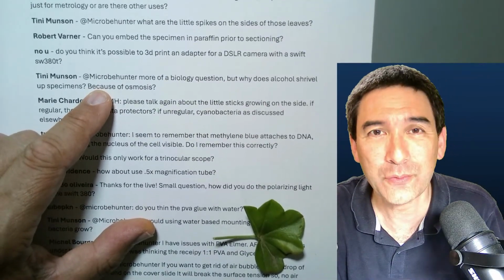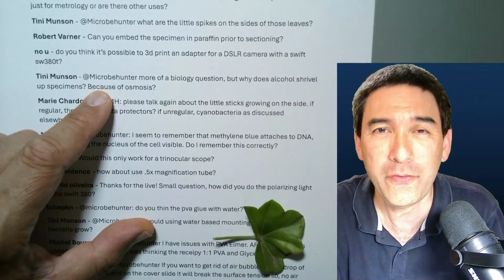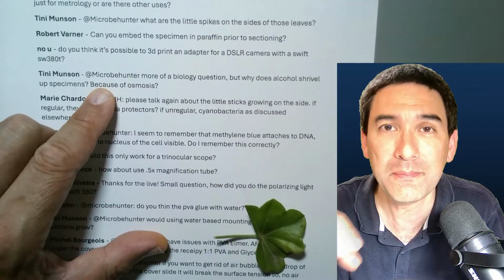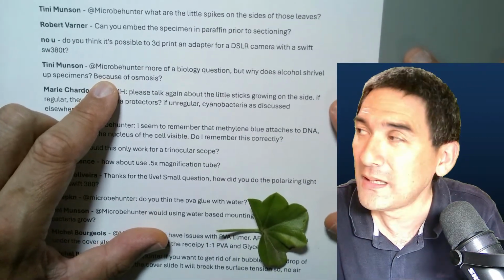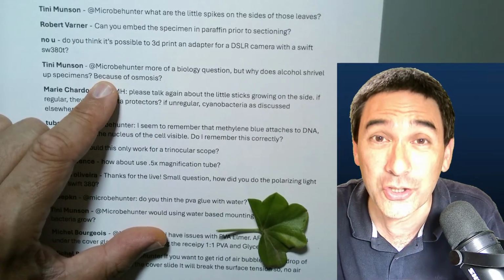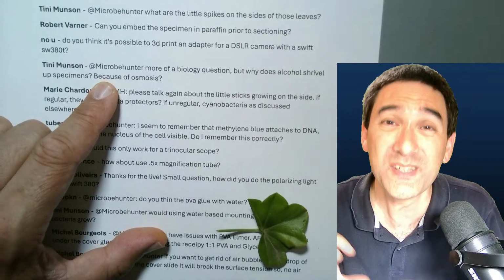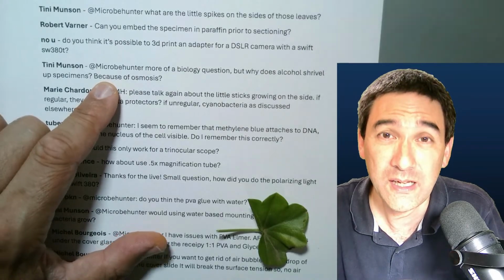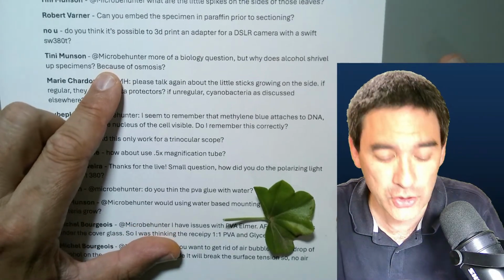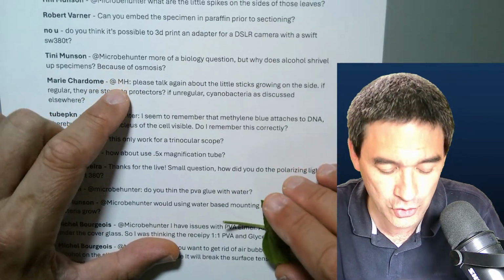And as I already mentioned, in microscopy, if you want to prevent the shrinking, they found out that you can add acetic acid, which is the acid found in vinegar, right? Because this has a compensating action and causes the cells to swell again. So there are actually recipes for the correct mixture.